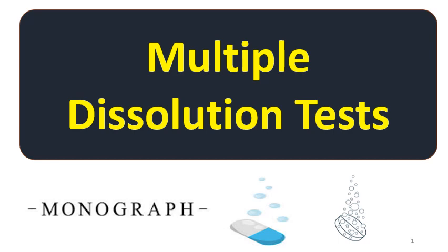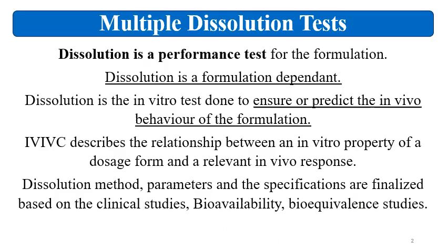So this video will be an interesting video, and in this video we will see why some of the monographs in the pharmacopoeias enlist the multiple dissolution tests, and what are the requirements for the product if there are multiple dissolution tests. So we will start from a little bit basic about the dissolution.